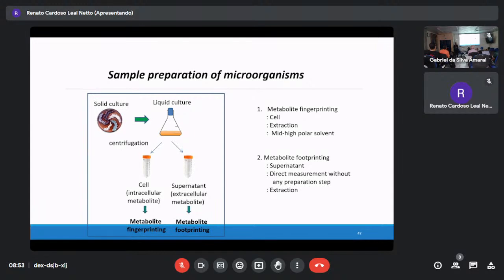But what's the problem? When I use microbial media and add in ethyl acetate, two phases form. I take out the ethyl acetate phase and believe it's the footprint, the excreted metabolites. It can be, but what is the problem?